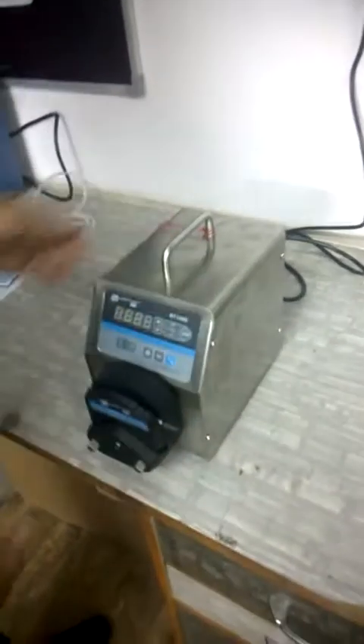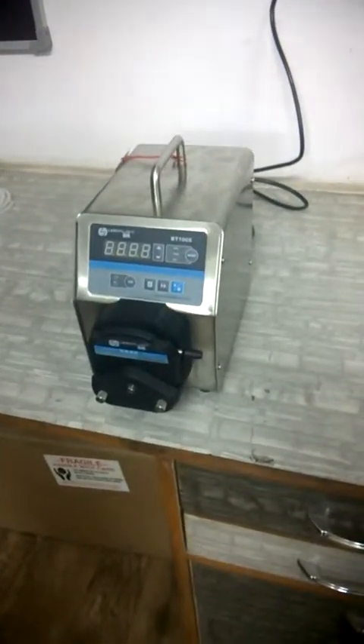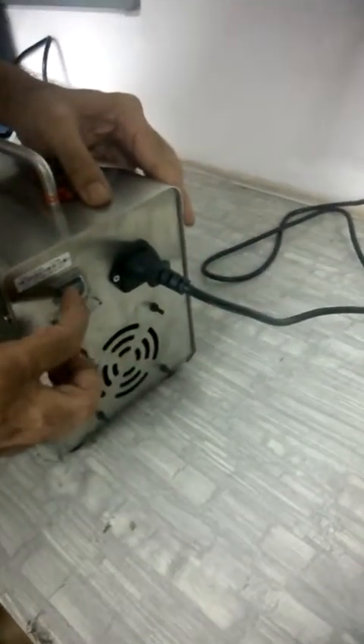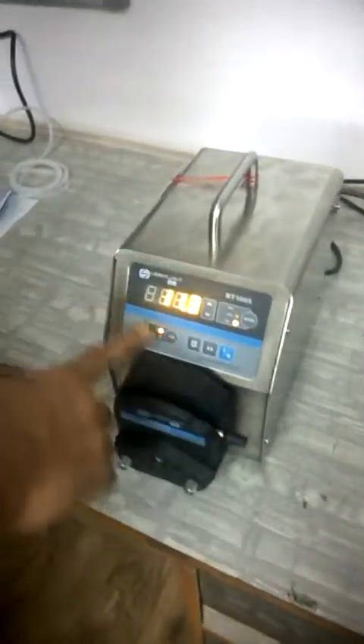This pump operates in continuous mode and we are demonstrating how to run it. Just put the power on — on the back there is an on/off switch. Put the machine on, and here is your keyboard.